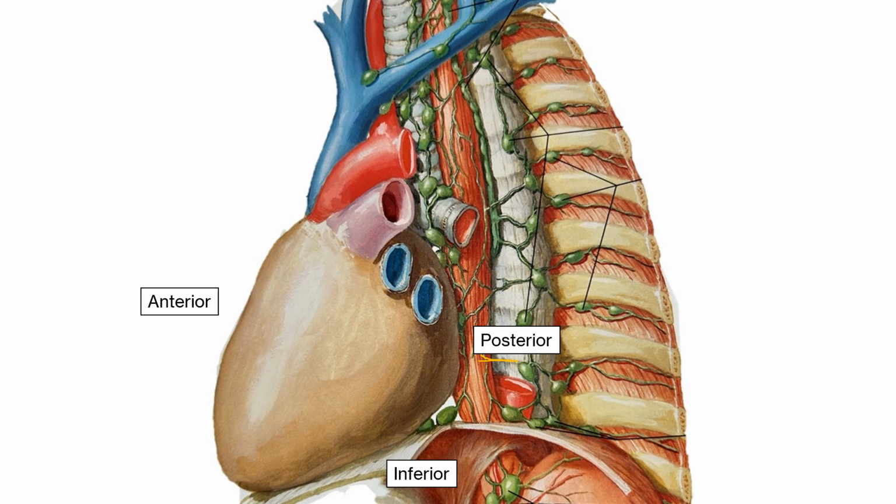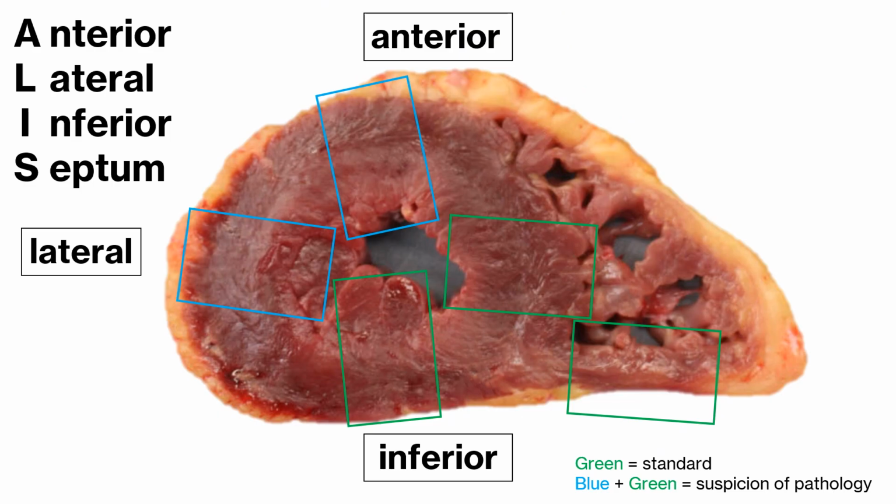So the anterior surface stays pretty consistent. The inferior surface rests along the diaphragm and is what you'll see when you have your apex to mid cuts, where truly posterior hangs out near the atrial area or the base of the heart. Why this is important is that you'll hear Dr. Morris often refer to ALICE, the acronym. Before we get into that, we'll get into standard heart sections.